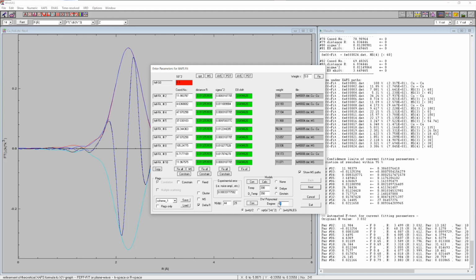Well, this can be just reduced to 0, which is just one Debye-Waller factor then, or what we're going to use now is a polynomial degree 1. And so this leaves basically 2 parameters instead of 5.